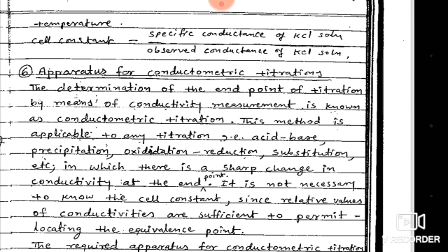With the help of a conductometer, we can measure the end point, that is, the equivalence point of the titration, be it an acid-base titration or a redox titration. Such a titration, where the end point is measured by means of an instrument known as a conductometer, is known as a conductometric titration.